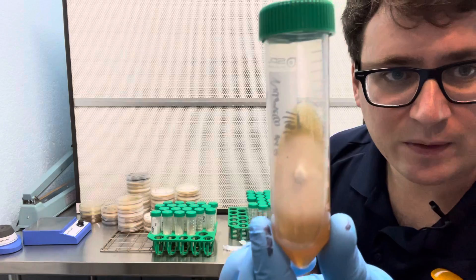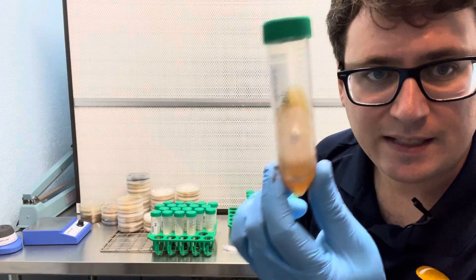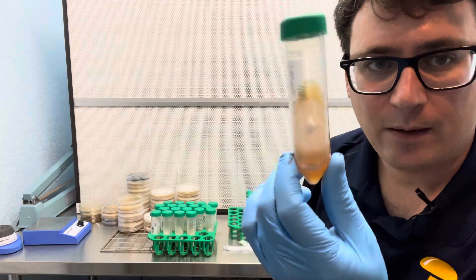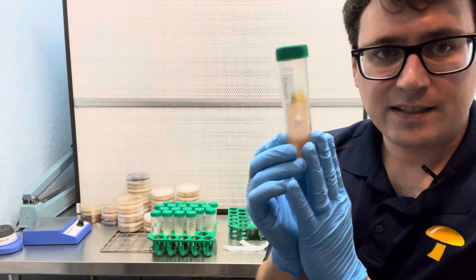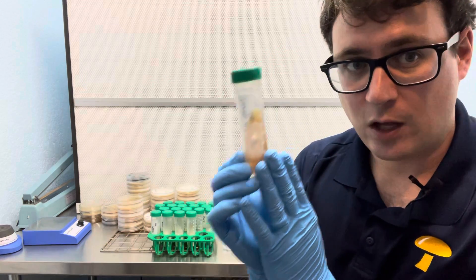This one's a better example. So this is the ideal stage. This is a Namiko mushroom. This is the stage I would put it into long-term storage.